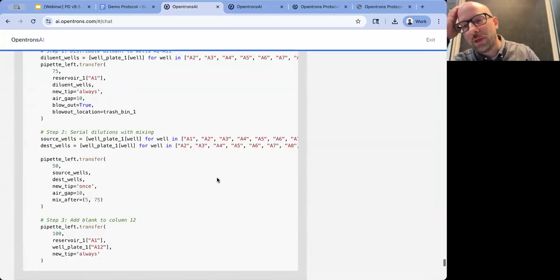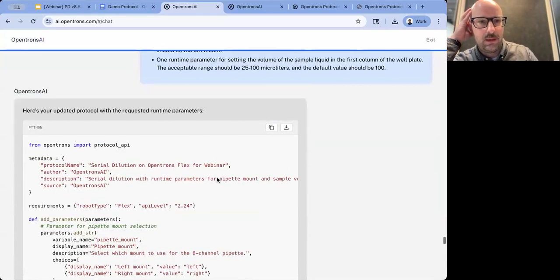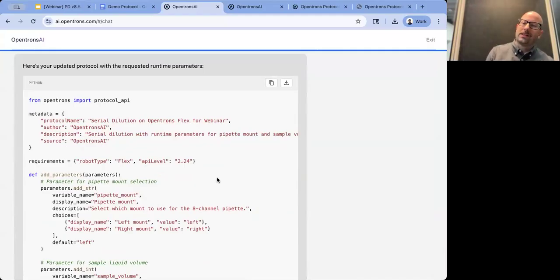You can't, yeah. So you can now, so this is something new, and maybe this is something that we'll cover in the next webinar for Opentrons AI. I think we'll do one in a couple months. We added an ability to attach files in chat. And so one of the reasons was for reagent kit PDFs, but the other reason was for CSVs. So that's something that is enabled now, and maybe I can demo that next time we do a webinar. But try it out. It's a new addition. I believe it's in production already, but I can check that.